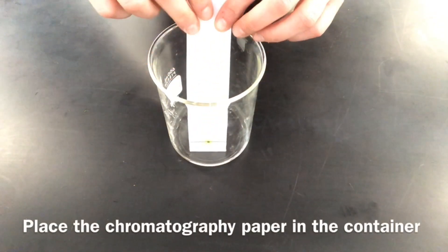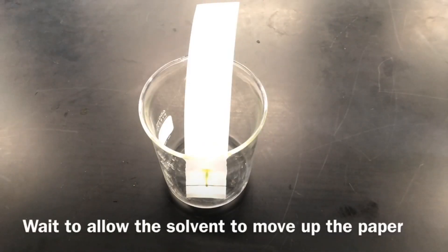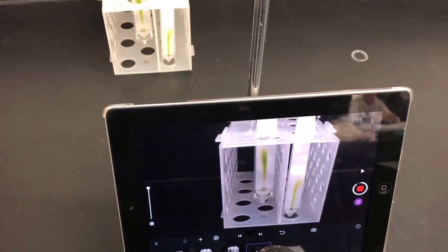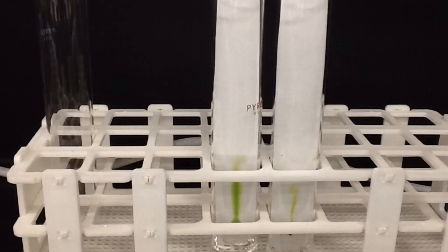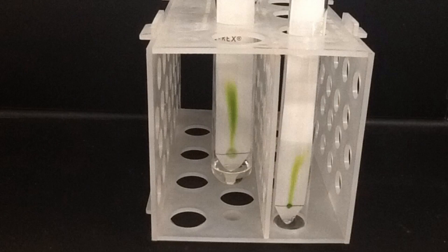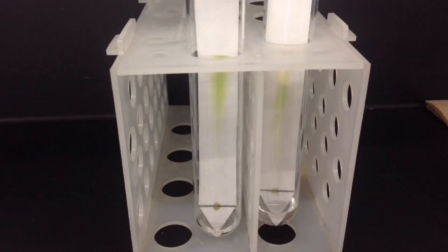Once you've prepared your container, place your chromatography paper gently into it and allow the solvent to begin moving up the paper, carrying the different pigments with it. It's important to keep an eye on the solvent front, because the pigments will stop at different distances relative to how far the solvent front goes. One fun thing to do here is to record it as a time-lapse video — you can see how the solvent front moves up and the different pigments stop at different distances along the chromatography paper, which will be relevant in our calculation soon.